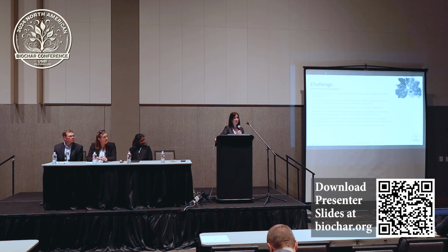But the bad news is exactly the same thing. Because we have a large number of applications, potential feedstocks, and pyrolysis conditions, that means that we have challenges in characterizing all those materials and understanding what needs to be done. So we also have new uses, as I mentioned, and better testing will always come. There's always going to be refinement in testing that is probably cheaper and more accurate. And the testing has to keep up with all these new uses of biochar. So that also presents a challenge when developing these standards.